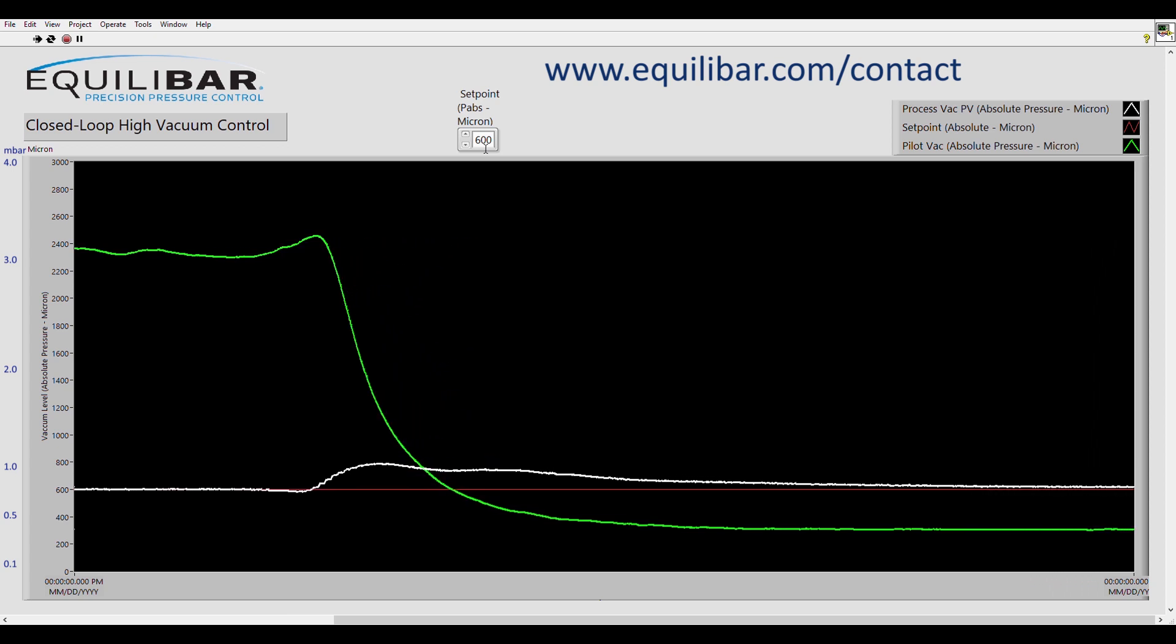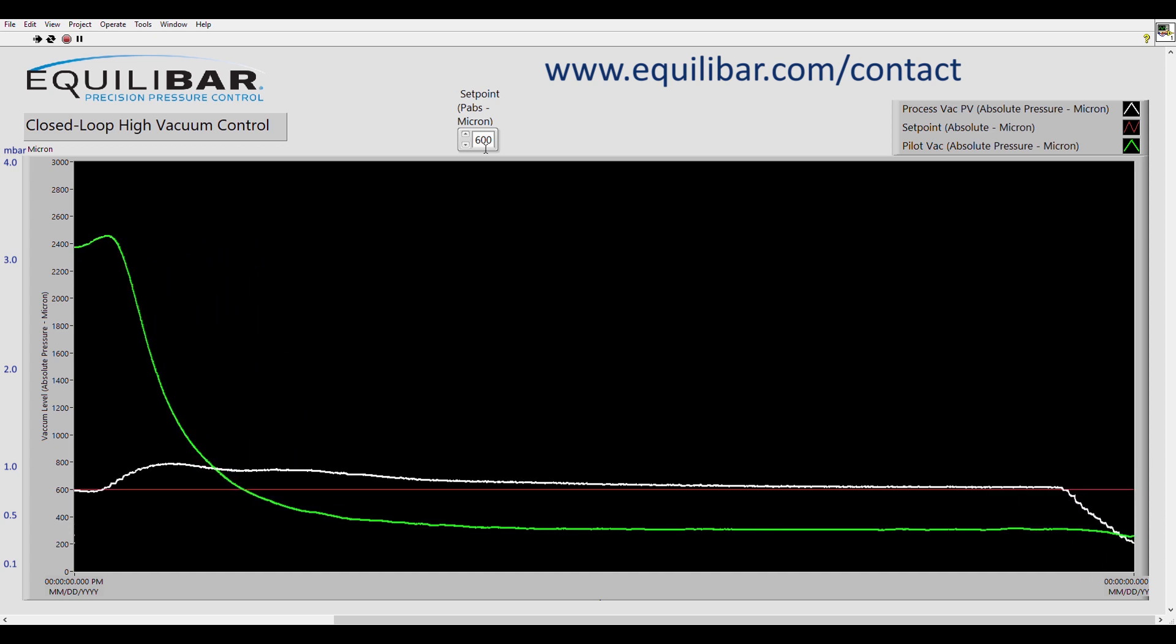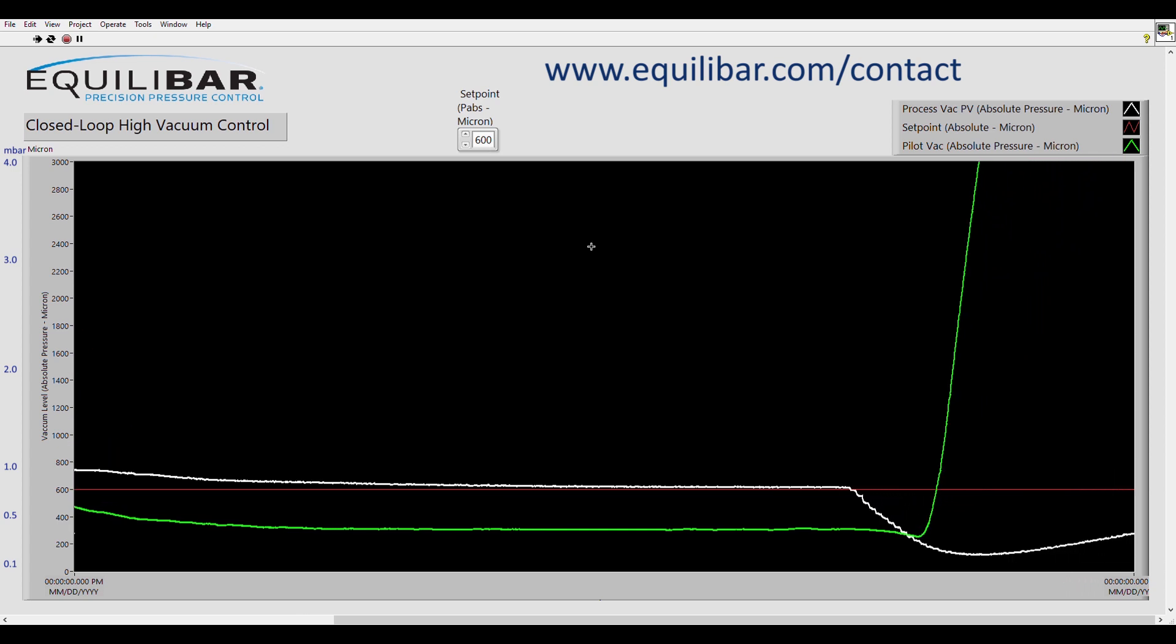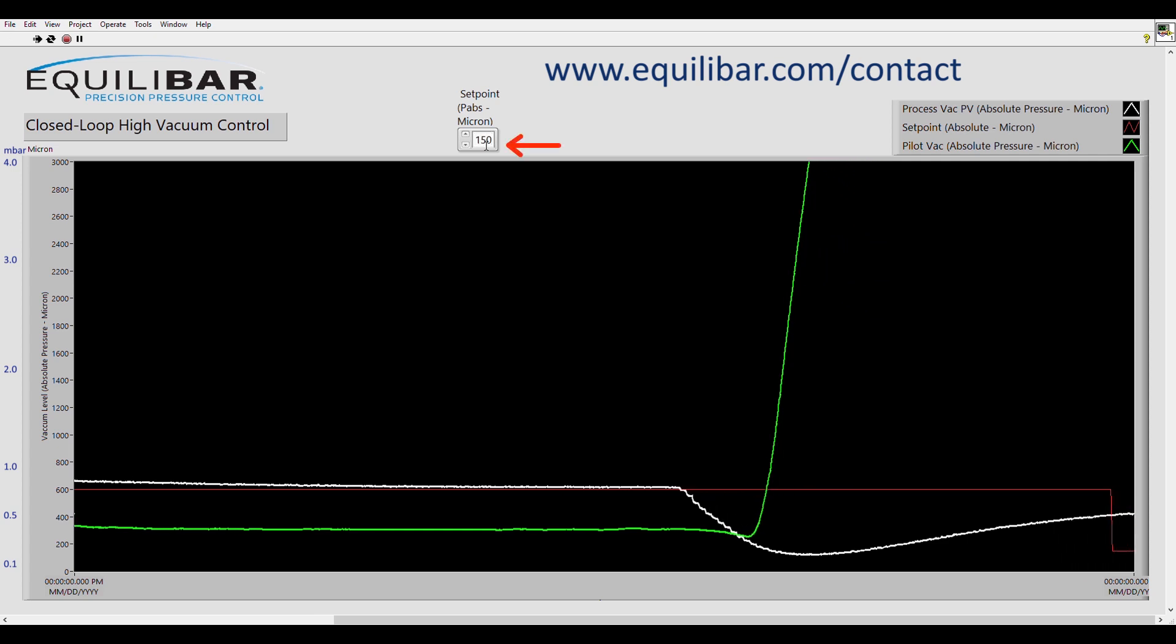Now let's explore the lower absolute pressures. We're going to reduce the mass flow so that our pump has capacity to go down to around 100. We're going to change the set point from 600 to 150 micron.